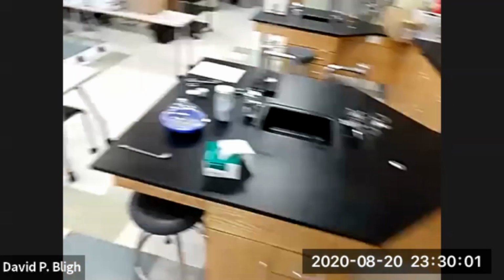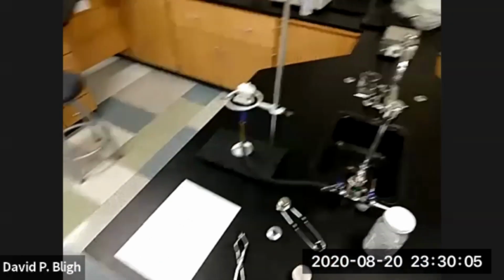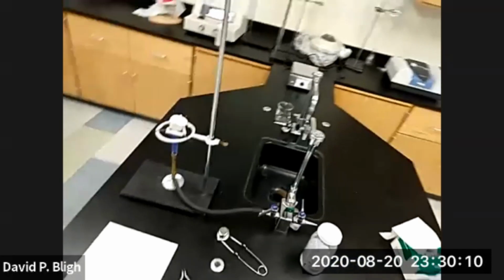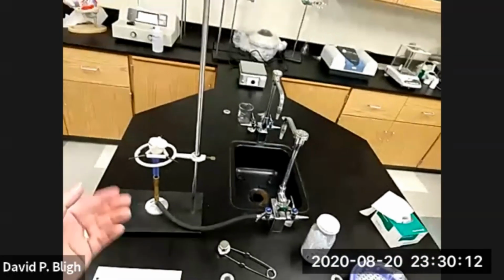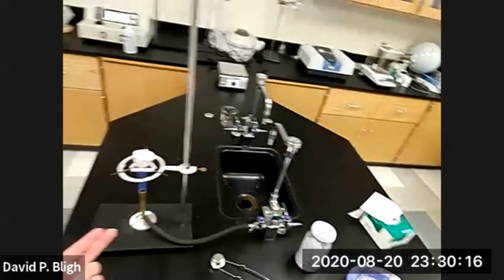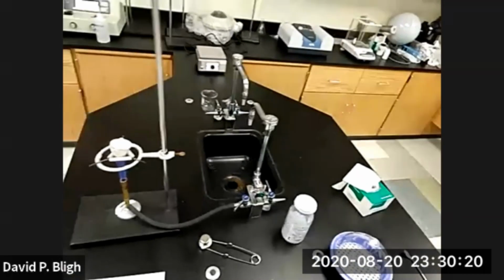Because the difference in mass between before we heat it and after we heat it is going to be rather small. Now, we're going to be heating the compound in one of these crucibles. One compound, the copper sulfate hydrate in this one, and the sodium hydrogen carbonate in the next one.